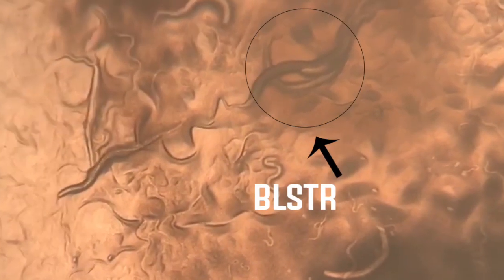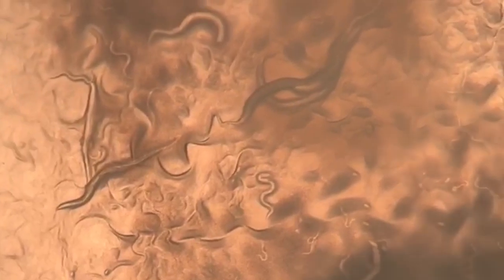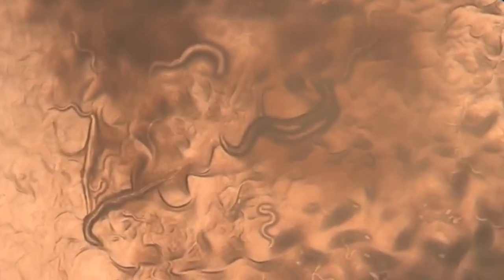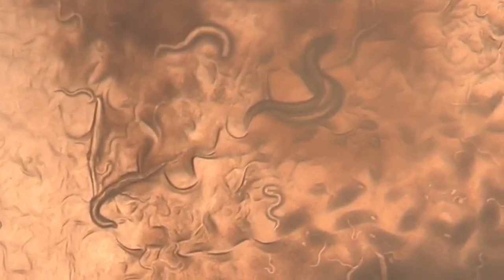Finally, here is the plate of worms affected by the blister strand of RNA. The worms that were affected by this strand had a phenotype of a huge blister on them. In humans, blisters are caused by damage to the epidermis through heat and friction. Therefore, the blister strand of RNA must turn off the gene to repair its outer layer.